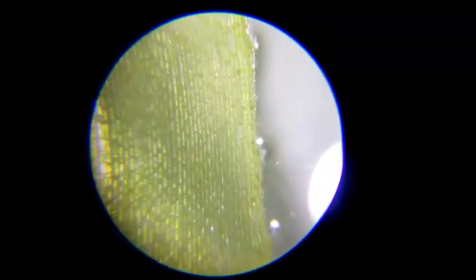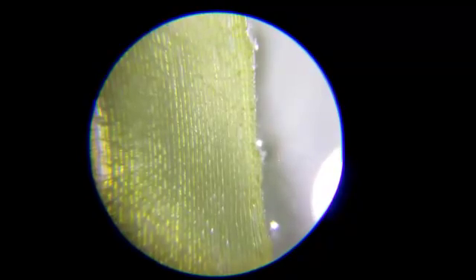So, as you're looking down here, you can see a lot of different rectangles in here. Each individual rectangle is a cell. And I'm going to try to find you a thinner part of the leaf so that we can see the actual chloroplast inside the cell.